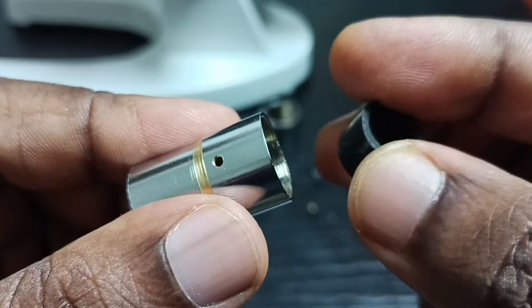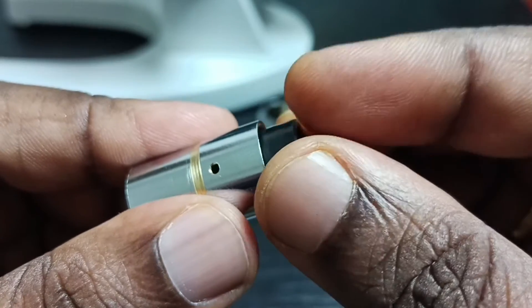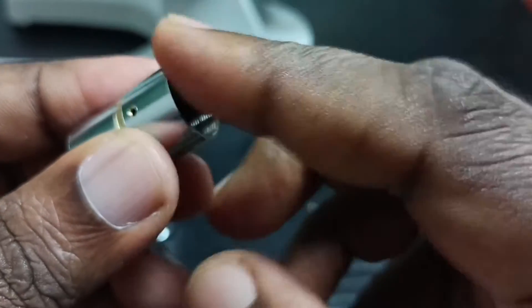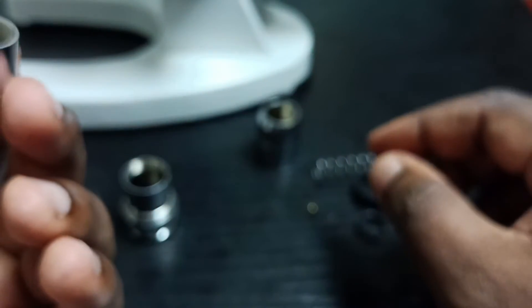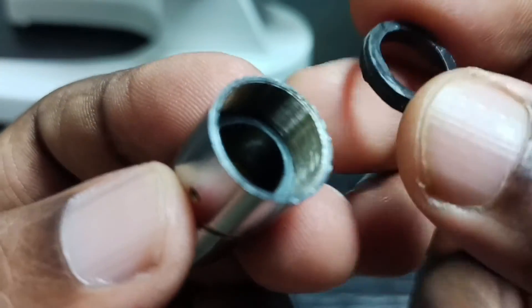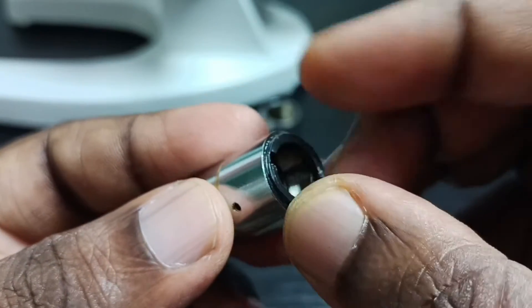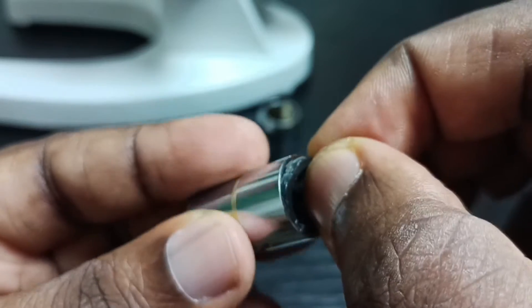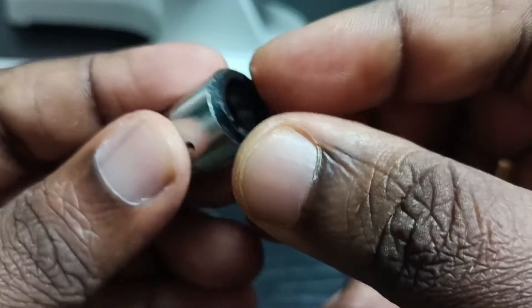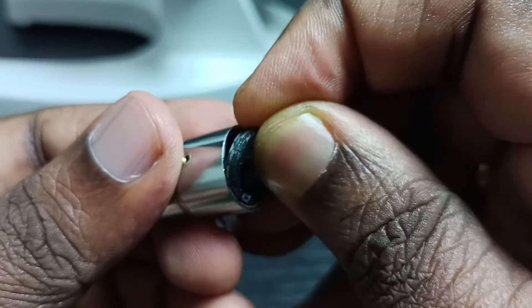Then insert this plastic. This plastic we have to screw in here — we have to rotate it slowly.